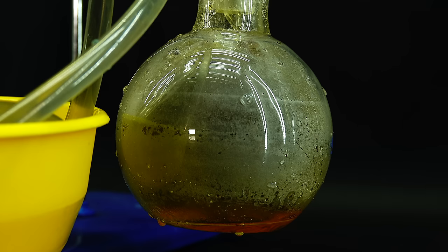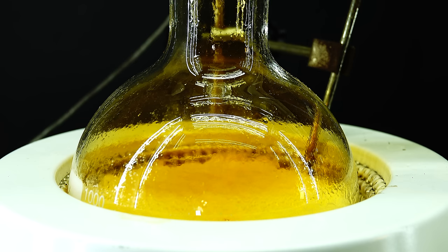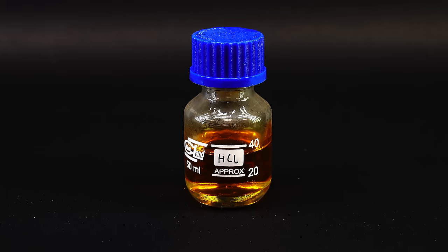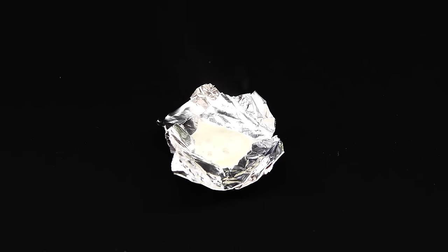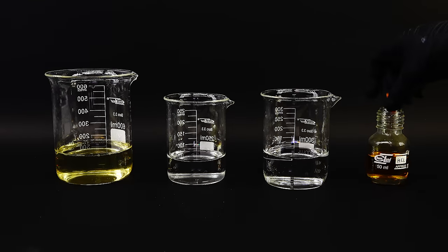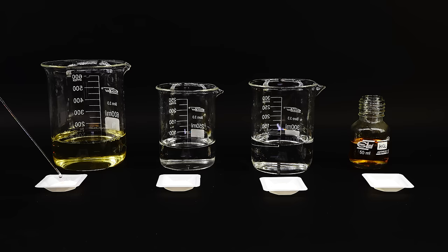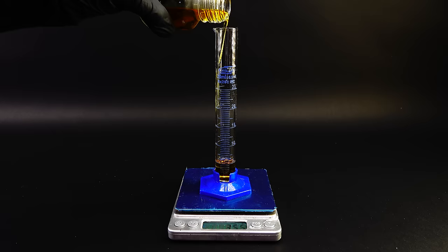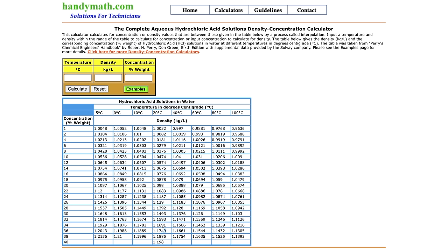I continued the distillation until there was no more stuff coming over. The resulting distillate was orange this time, which is really weird. I could also see some nitrogen dioxide gas in the apparatus, which meant there was some unreacted potassium nitrate from making nitric acid present. This could also mean that the distillate collected is made purely of nitric acid, but I can quickly rule that out since it readily dissolves aluminum foil, which normally is resistant to nitric acid. All the fractions obtained through the distillation are acidic, meaning they contain at least some acid, but to see how much I tested how each one reacts with baking soda — and honestly most of them are quite weak. I decided to keep the last and strongest fraction and get rid of the other ones.